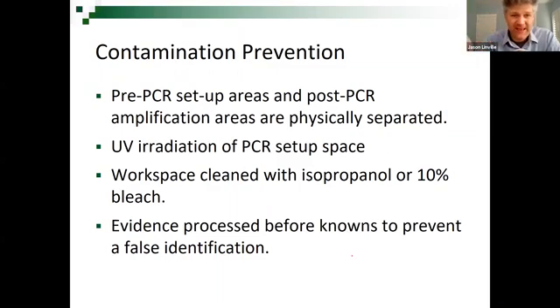And a way to prevent that, like I mentioned before when I was describing the setup areas, is you keep your amplification area separate from your setup area. So the pre-PCR, that means your setup area. Before it goes into the thermocycler, you physically take your tubes into another room and put them into the thermocycler, and that is your post-PCR region. And in the same room as that thermocycler is also all your equipment to do the analysis after amplification, okay? There's all the other steps: irradiate your PCR setup space, clean your workspace with isopropanol or other things. I'm not going to ask you for the specifics of that.